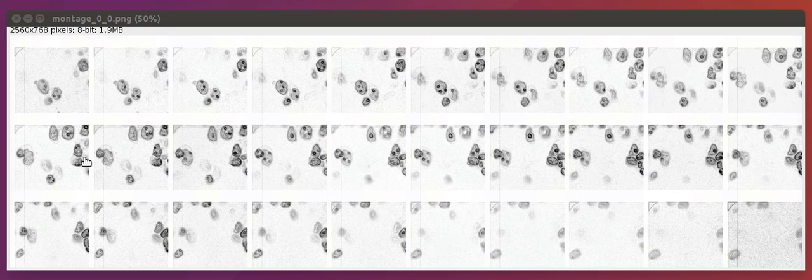Moving down, again, it'll be bigger and brighter, and this pattern will continue until it starts to become smaller and dimmer. And that is the pattern that we would expect, and so we would say this object here would be one cell.